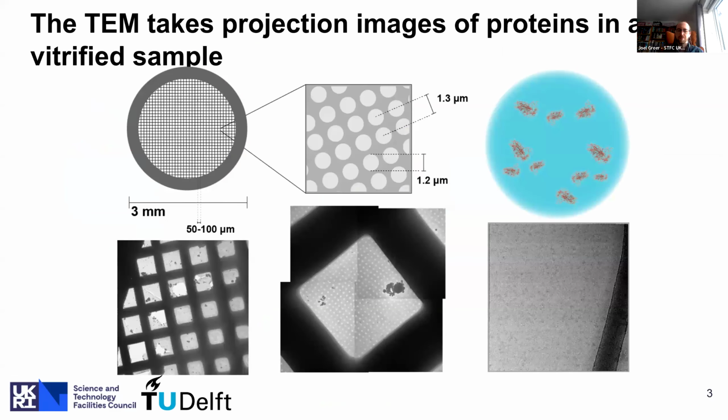Okay, so first you'll need to prepare a sample in the lab of the macromolecule which you want to determine the structure of via cryo-EM. You'll then need to collect thousands of images of individual molecules in your sample to use single particle analysis reconstruction techniques. So to collect those images, you can use a transmission electron microscope.